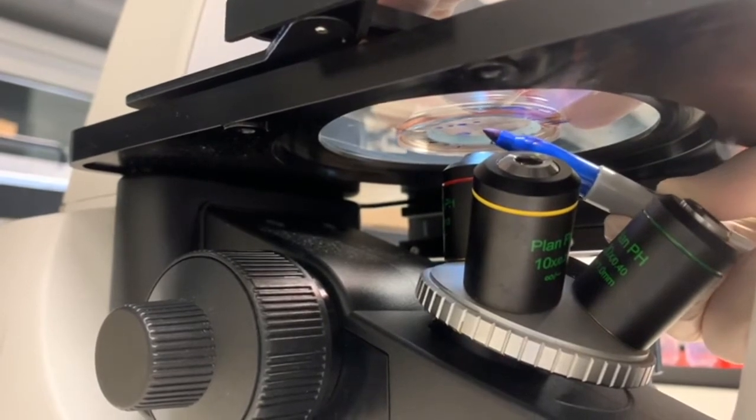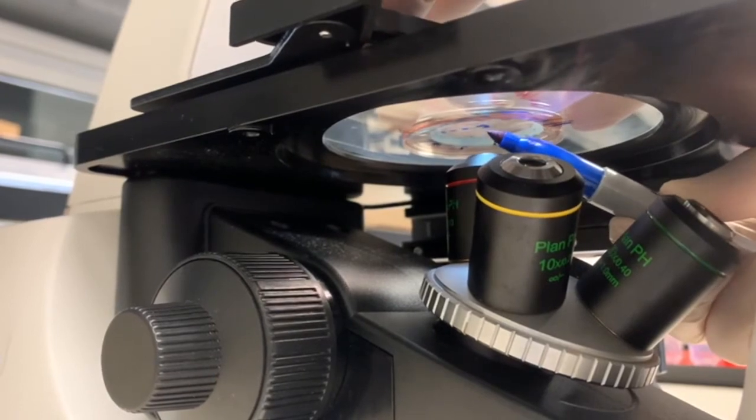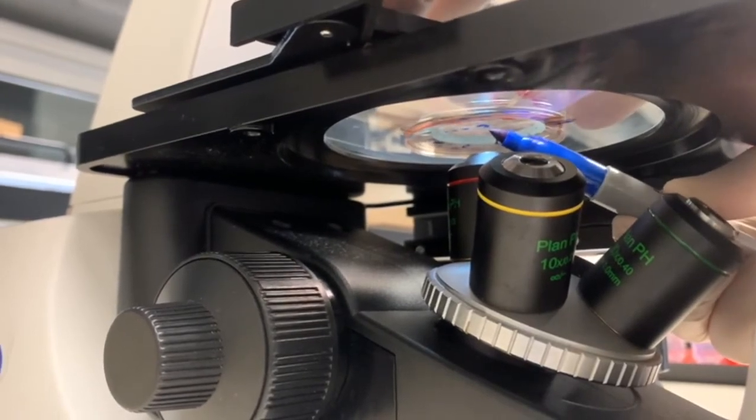Move the dish to change the field of view and keep marking the unwanted spontaneously differentiated regions until you cover as many as possible.